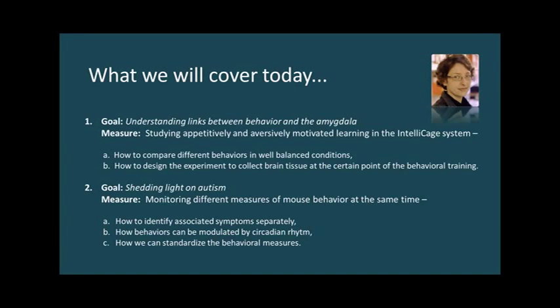So to study these circuits, we need to compare different behaviors in well-balanced conditions, as well as we need to collect brain tissue at certain time points following the behavioral training. So I will try to show you how we can do it using IntelliCages. In the second example, I will show you how we can monitor different measures of mouse behavior at the same time. In my lab, we test mice for different symptoms of autism.